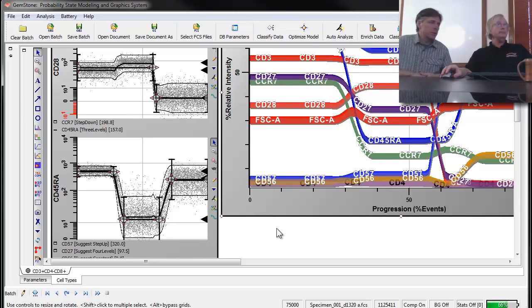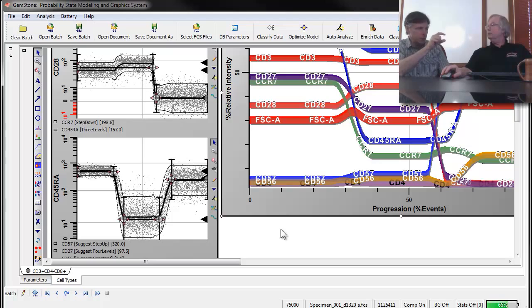We talked about this in earlier movies, Bruce, but what's happening here each time you add one of these is that the program is reorganizing not just the events that are in the one plot we're analyzing, but if it moves an event from one plot, it's moved in all of the other plots. It's along the same x-axis for each event. Right. Another way of saying that is each event here is vertically aligned with other events in other expression profiles. Okay. So when they move, they all move together.